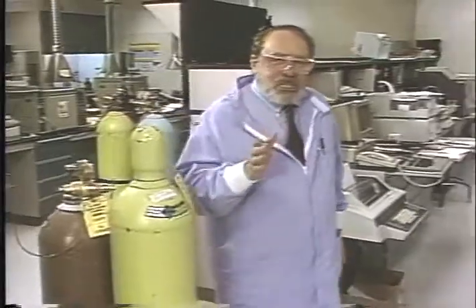We can work safely with formaldehyde by following proper work practices. Be aware of the materials that contain formaldehyde in your work area. Use proper personal protective equipment and be prepared in case of a spill or other accident. Remember, participating in the required training and complying with the new standard will make working with formaldehyde safer and easier for everyone.